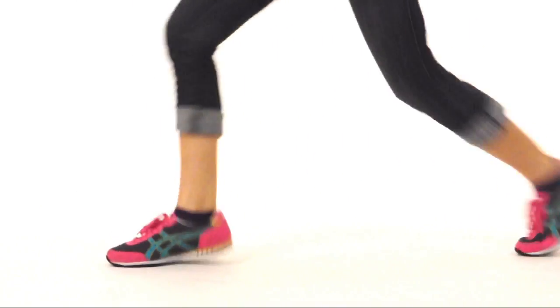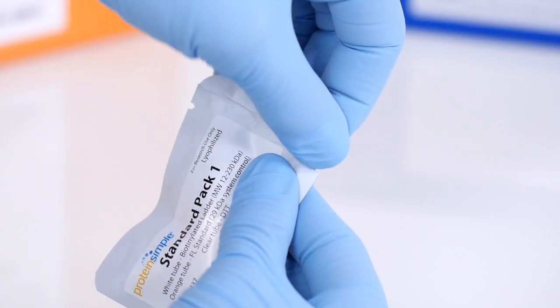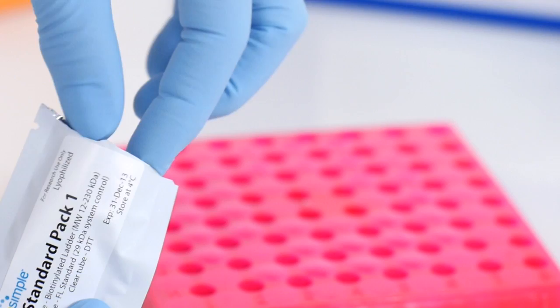Grab your blue reagent box out of the fridge and let's start pipetting your plate. Grab a standard pack from your blue box and remove the four tubes inside.